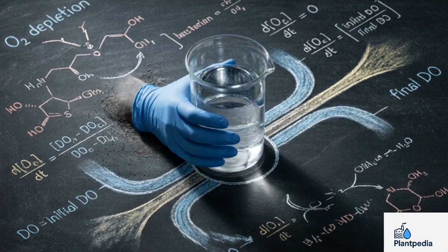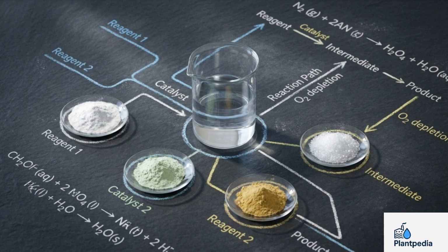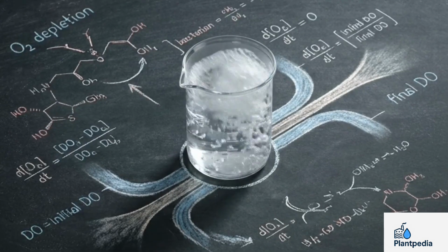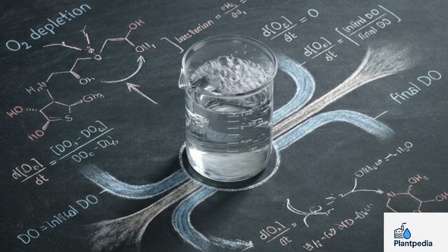Step 1 is preparing the dilution water, which will serve as the baseline environment for our sample. Take standard distilled water and add a specific combination of essential nutrients: phosphate buffer, magnesium sulfate, calcium chloride, and iron chloride. Once the nutrients are in, aerate the mixture vigorously. The aerobic bacteria require an environment completely saturated with oxygen to survive and process the waste.